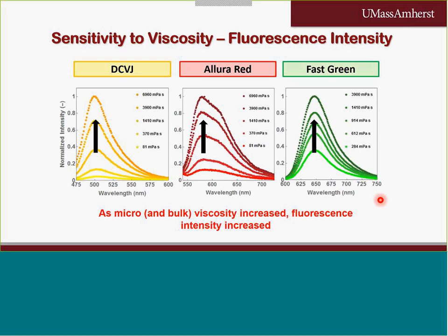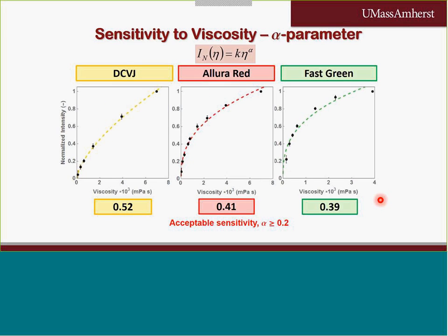viscosity. This has been evaluated in glycerol water systems, which is normally what is being done for molecular rotors. Also, the relationship between normalized intensity and viscosity was characterized using the Forster-Hoffman equation, and relationships for the synthetic dyes are similar to the one that is obtained by one of the conventional molecular rotors.